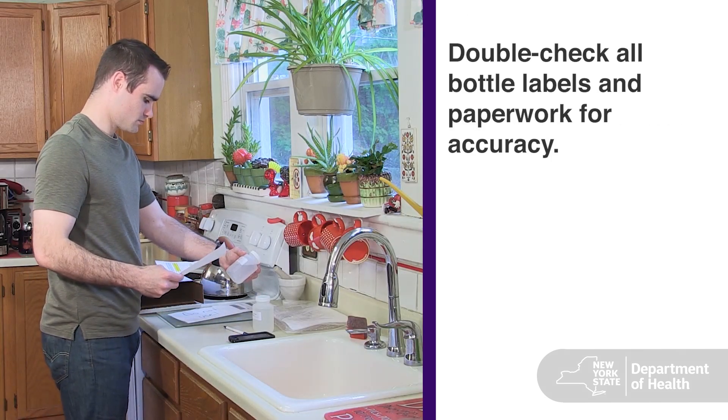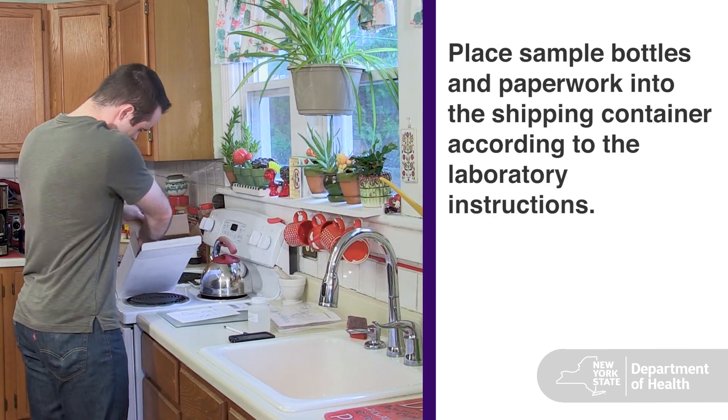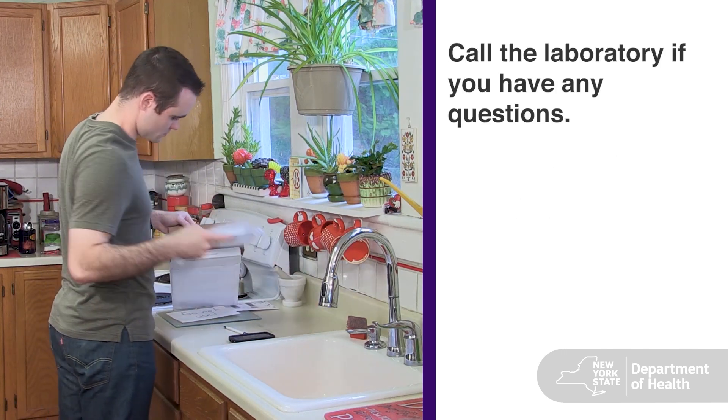Next, fill out the laboratory paperwork as directed. Make sure that everything on the sample bottles and paperwork is complete and correct. Place the sample bottles and paperwork into the shipping container according to the laboratory instructions. Call the lab if you have any questions.